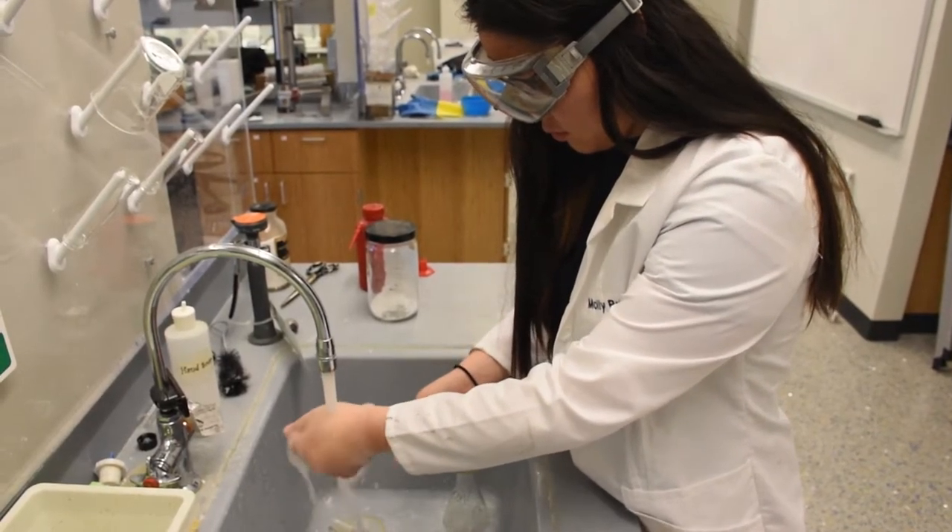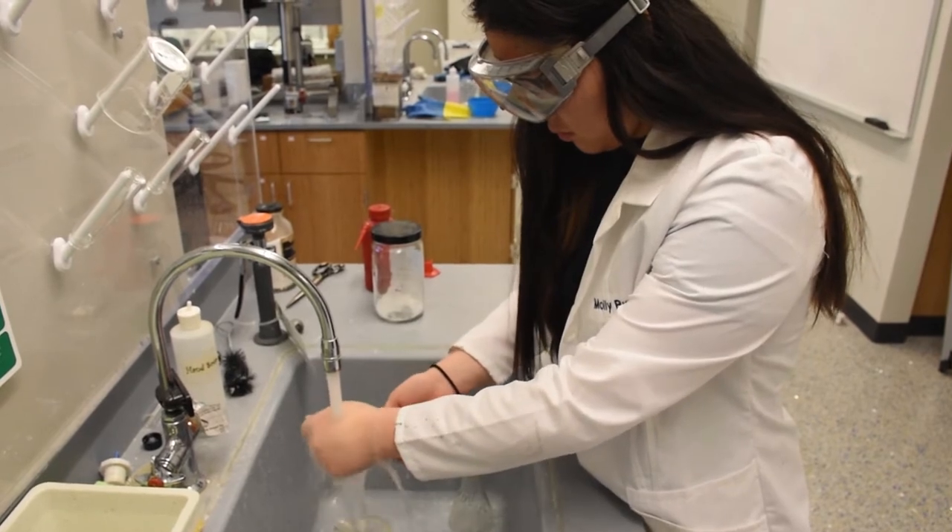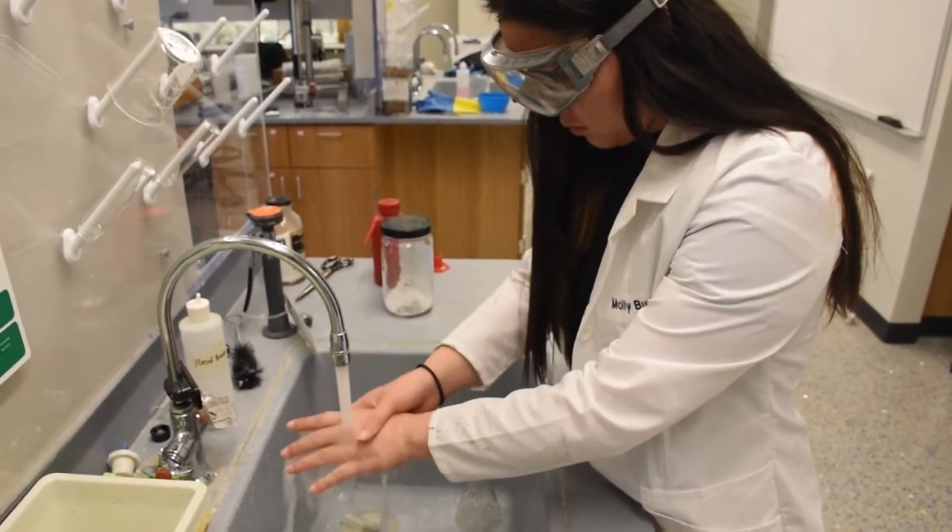If you spill an acid or base on you or someone else's body or clothes, immediately rinse the body part under running water.